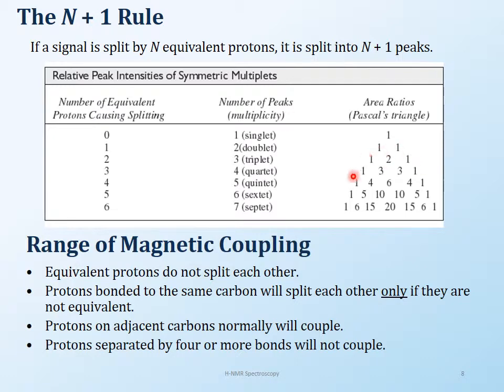Okay, this is also the splitting that you see, by the way. Okay, so for two, you will see a triplet. For three protons, you will see a quartet. It's always an n+1 system. Okay, so you'll see n+1 peaks. So if a proton is looking at 1, it's looking at 1+1. Okay, if a proton is looking at 2, it's looking at 2+1. So that's how you're looking at all of these splittings that are going on.